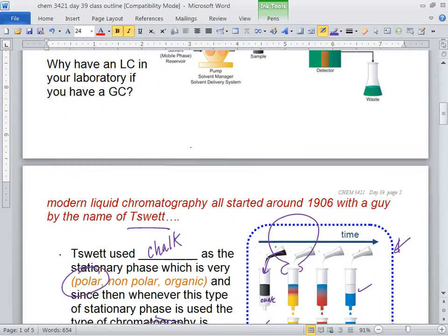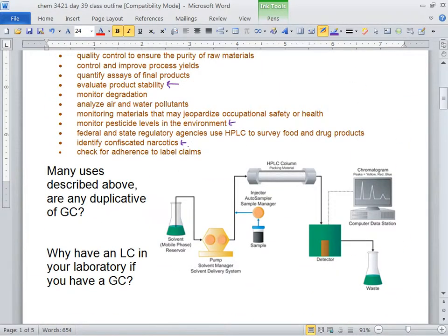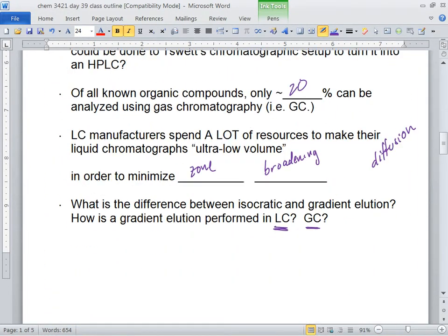Temperature on HPLC too, right? Yes. Yeah, they have this thing in a big oven. And it doesn't really help. I think changing temperature doesn't really help so much. What it does is just makes things look prettier, which is kind of nice, right? If this is your business, say lab X analyzes the narcotics in someone's urine and lab Y analyzes the narcotics in the same urine, and then you take a look at the two. Ooh, this one looks prettier. Yeah, so I think it just sharpens up peaks is all the temperature does for LC.